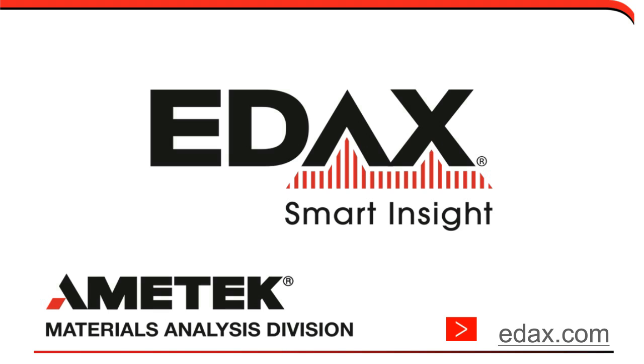Is it possible to do simulations according to our known structures? You can do simulations and get the zone axes. I have not seen anyone try to do imaging of simulated maps, for instance, to see what the PRIAS images are. That would definitely be a next step in the theory of the PRIAS imaging, is to go back to simulations or models and the basic theory, similar to what is done in transmission electron microscopy and diffraction contrast in that technique.